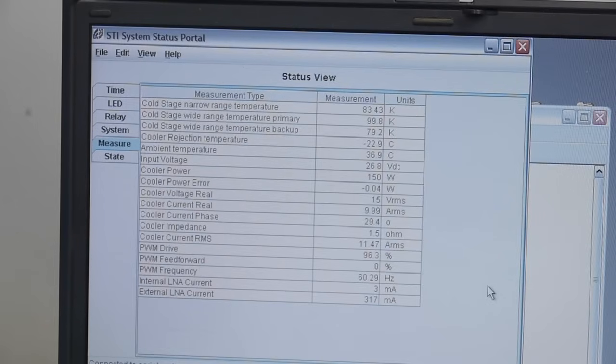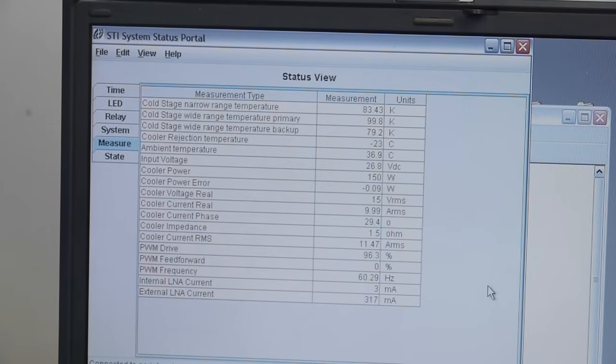Here's an information screen from the control software showing the current state of the board. As you can see it's running at right about 150 watts and the cryo cooler itself requires 15 volts rms at about 10 amps. The measurement system is pretty cool it even shows the phase angle and the rms total current including the imaginary part. The pwm drive is running pretty close to 100 percent you can actually squeeze a little bit more out of it by increasing the input voltage and the software compensates for the total rail voltage that's generated from the input and will actually back the pwm duty cycle down as you give it more input voltage up to a point.